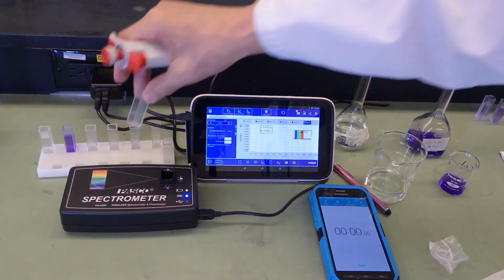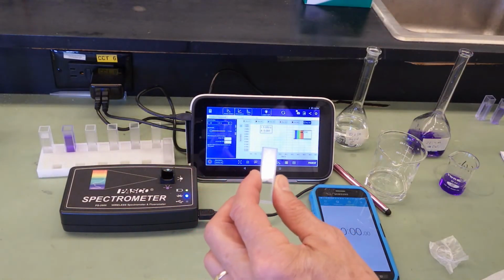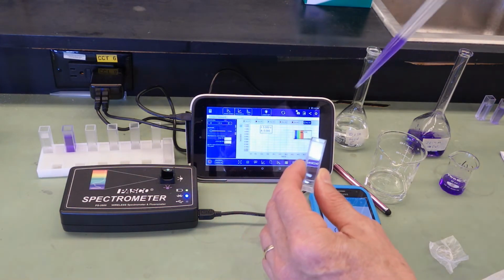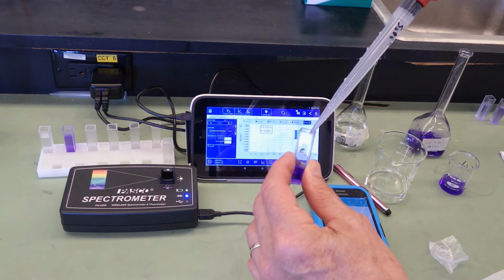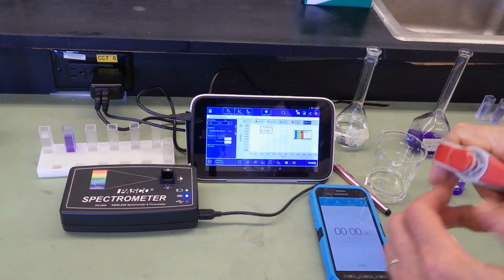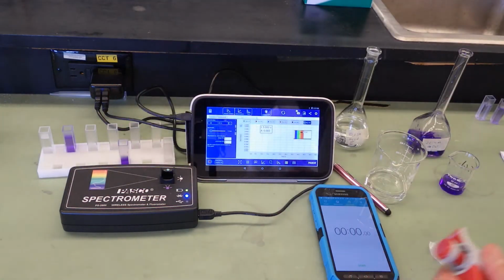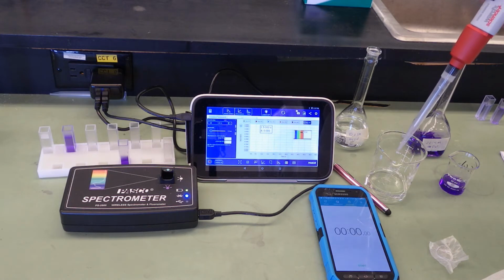So here for part B, I'm adding 1.5 mL of 2E minus 5 molar crystal violet. You can take as much time as you need to do that. Now I'm going to change the tip on the pipette so I don't mix my solutions. I'm going to add 1.5 mL of sodium hydroxide.